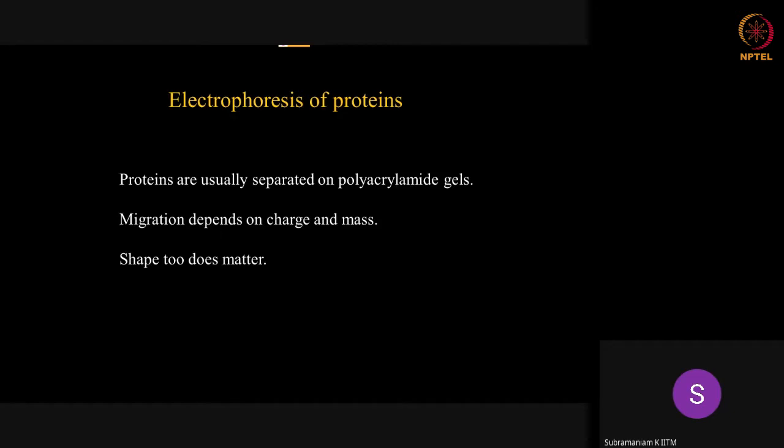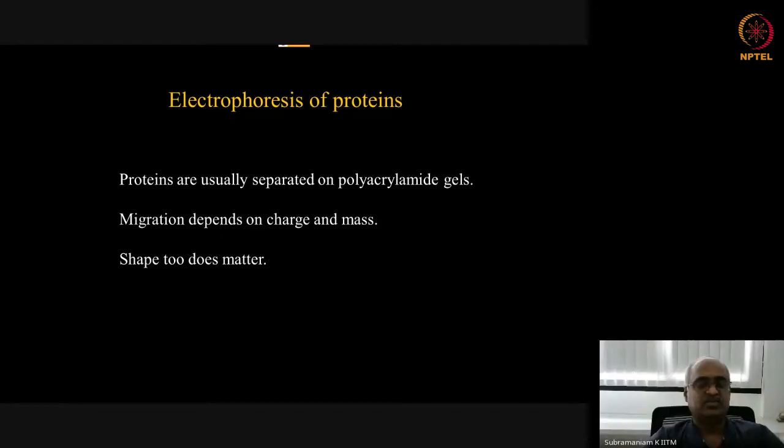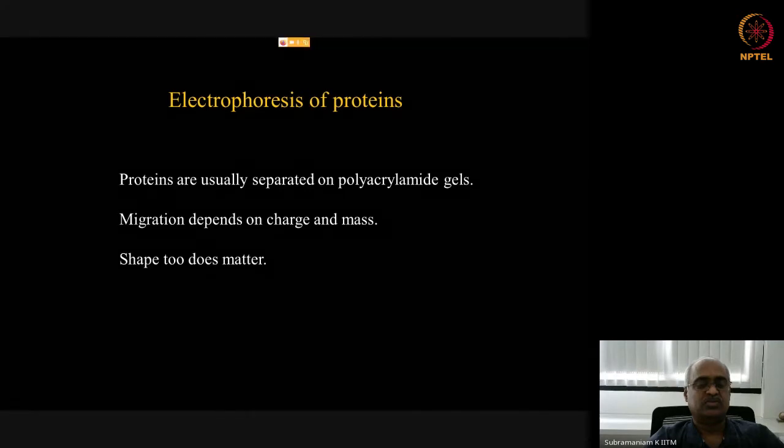In the case of agarose, it's a long chain polysaccharide. It's obtained from seaweeds, and it is in powder form, but when you soak it in water and hydrate it, usually by heating, the agarose gets hydrated and swells into a gel-like consistency. So that is how that is made.